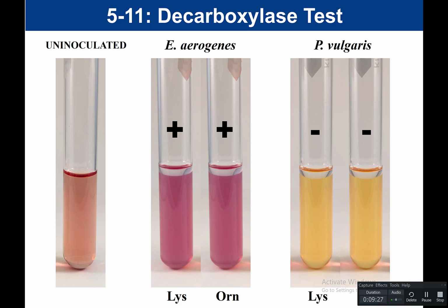However, if given tubes, you should be able to analyze those tubes and tell me what it means, right? And so if we see the purple, it tells us that the pH is alkaline. The pH had gone up, which means that bacteria did decarboxylate the amino acid because it produced the diamine. The diamine raised the pH, which caused the bromocresol purple to turn purple. That's our positive. The yellow is going to be the acidic.